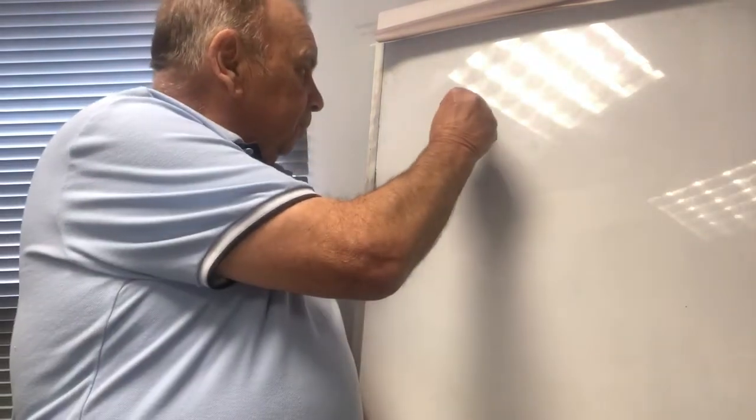Hi there, in this short video clip today I'm going to look at tests for gases. I've got a container, I've got a test tube, I've got a gas jar full of a gas. How do I know what gas it is? Well, let's look at a test for hydrogen.